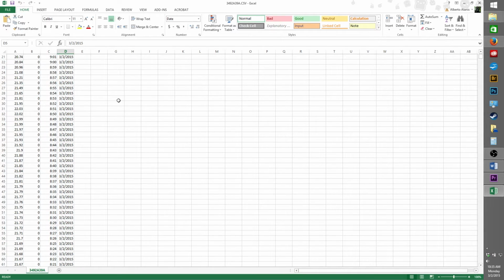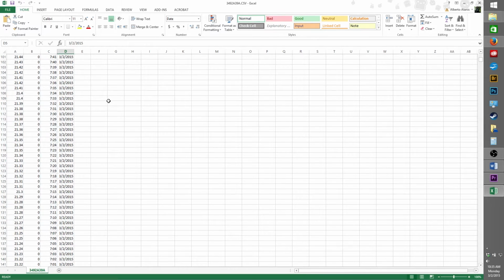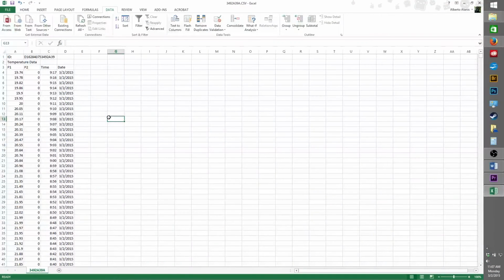As you begin to scroll down your spreadsheet, you may feel overwhelmed by the amount of data the Traceable Excursion-trac can observe and record. Not to worry though, with Microsoft Excel we can apply filters to your column so that you can only see the data you want to see. Let's go through 2 examples to get you reading your data efficiently as quickly as possible. First, let's start by filtering our spreadsheet to only show what happened on one day.